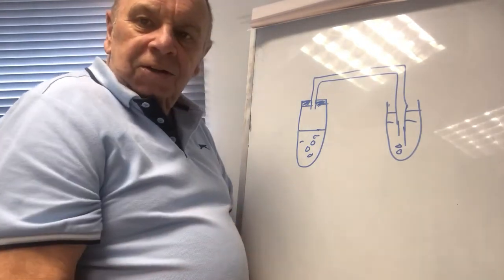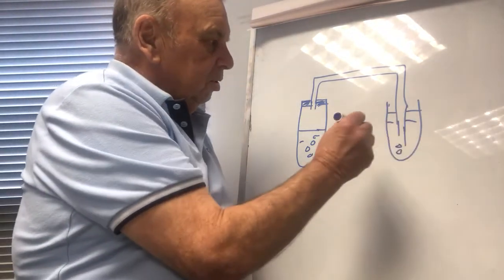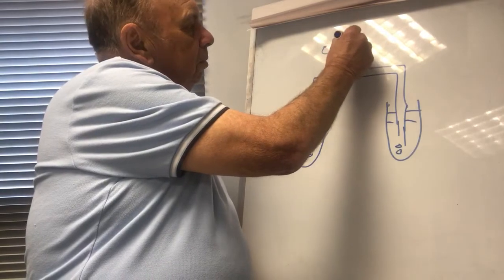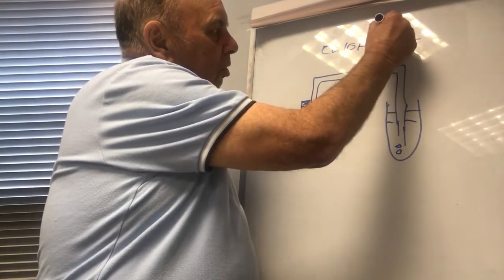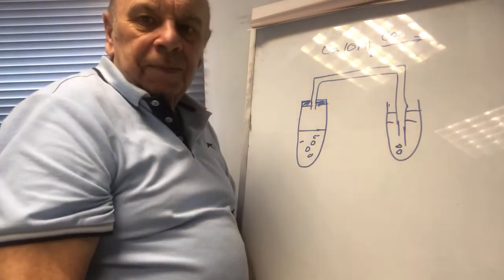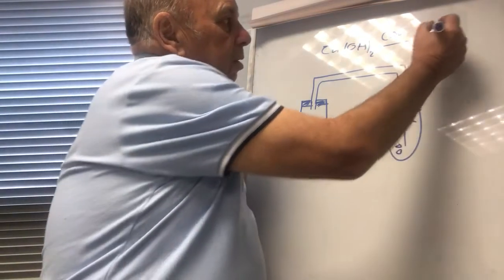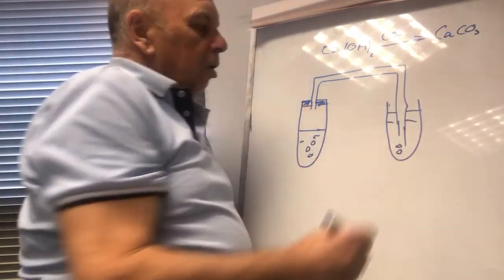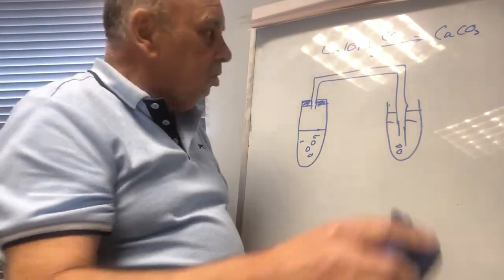And why it turns turbid, I'll tell you this now, because this is a solution of calcium hydroxide. I pass CO2 gas through that and it forms an insoluble precipitate of chalk, calcium carbonate. So that's a test for carbon dioxide.